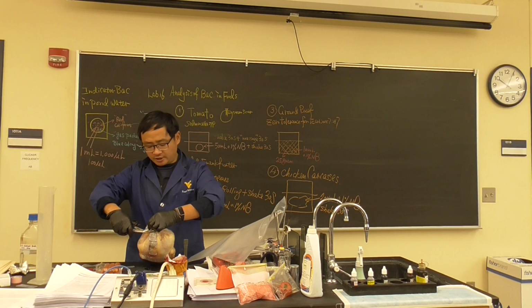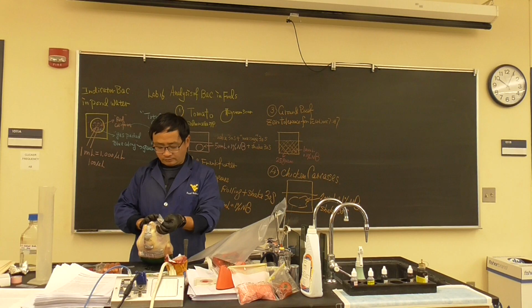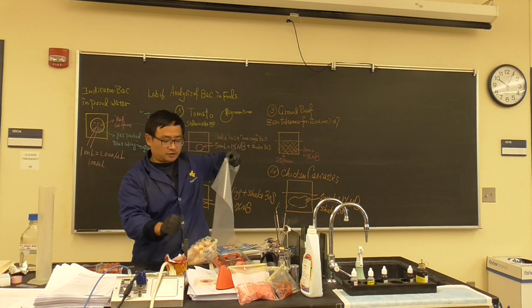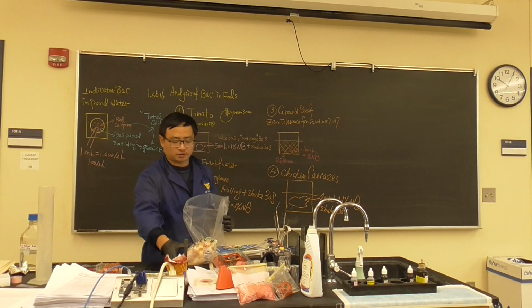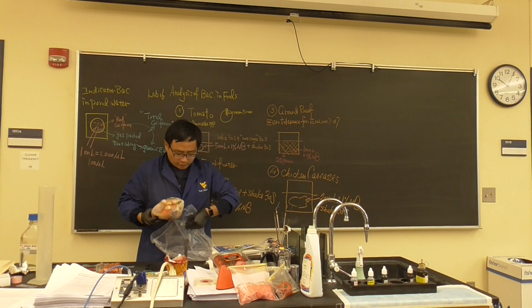We're going to put the birds in. I'll show you how we do it. Make sure that this is opened. You have 2 people working together, okay? So you go inside. We do this all the time.